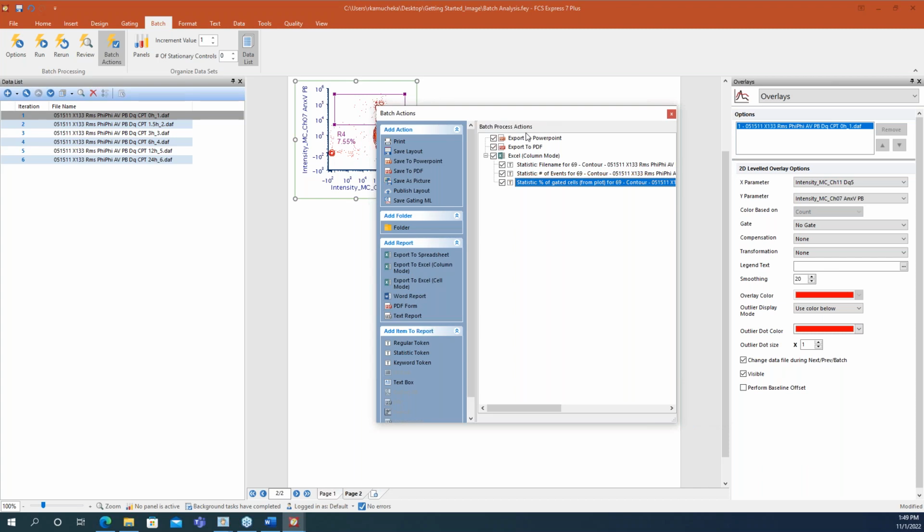After I save this, this is all part of my analysis template. So I don't have to come back here and recreate any of these elements. It will be saved and I'll be able to just bring back those data files or the new data set, put them in as long as I've segmented them all the same or they come from the instrument with the same parameters. I can drop them into this experiment and just pick up where I've left off, maybe move some gates around, do the kind of minor things to adjust my analysis appropriately, and then create these reportables.